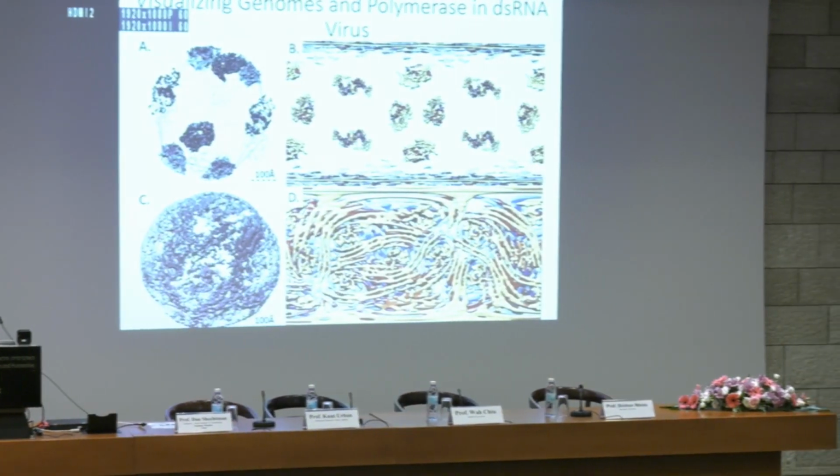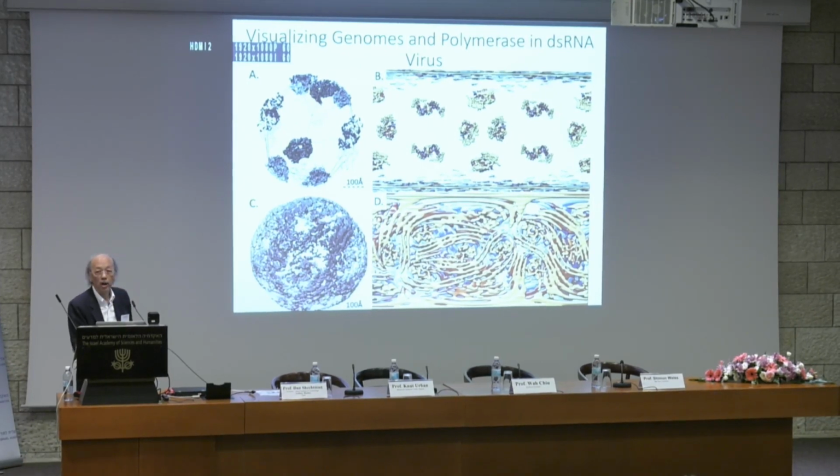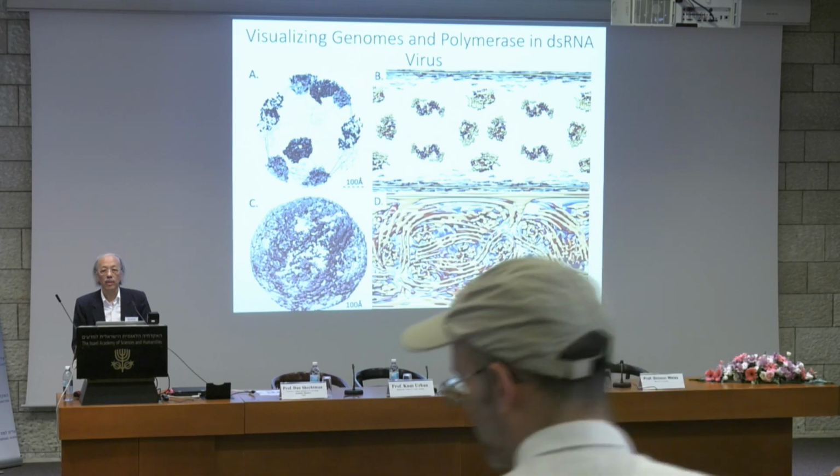Then we can actually see the RNA molecule that is quite ordered in such a way. In every one of these RNA viruses, the RNA is arranged the same way. And in fact, we can actually see the RNA polymerase at 10 out of the 12 vertices as well. So those are possible. But is there a reason for that? Biology likes precision. We see precision everywhere. Why, with the DNA, isn't there that precision there?